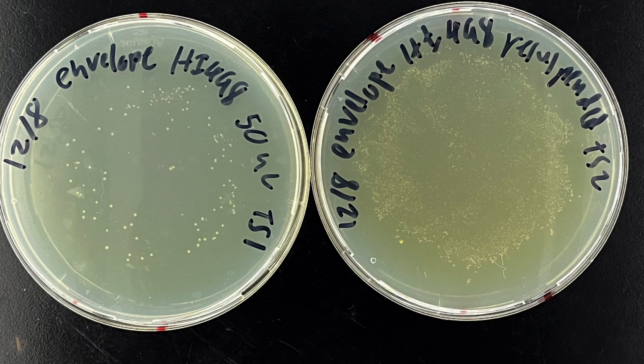Now, the reason that we plate different amounts of bacteria during our transformation is because the amount of colonies that we see is going to be dependent on the type of cloning that we've done, the type of transformation, the type of competent cells, etc. So on the left here, we have that 50 microliter one that Jaden plated. This one turned out to be a very nice amount because we can see a decent amount of clones. These clones are very well separated, whereas the resuspended version, or the one that he spun down and then plated the rest of, you can see that is just way too much. So you can't comfortably pick an isolated clone.